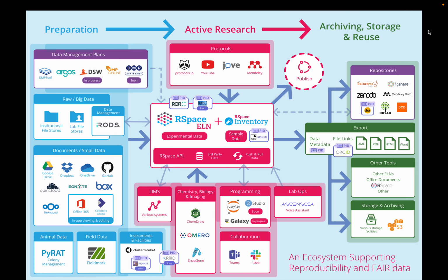Today we're going to look at a fairly common workflow that shows how RSpace can be used as a very effective research data management tool. Now, if you're already an RSpace user, you're aware that RSpace can be the central digital hub of your lab, and that it interacts with a range of other data management tools, like, for example, digital identifiers, external data, different point tools that you use in your particular field of research, calculation tools like Jupyter and, coming soon, Galaxy.